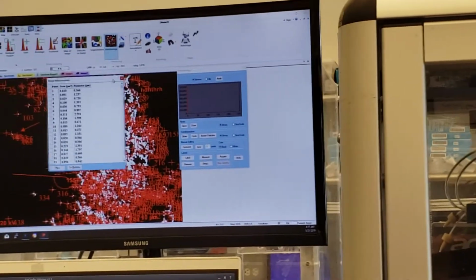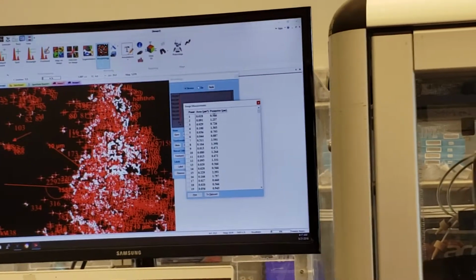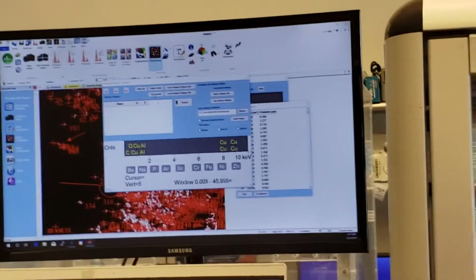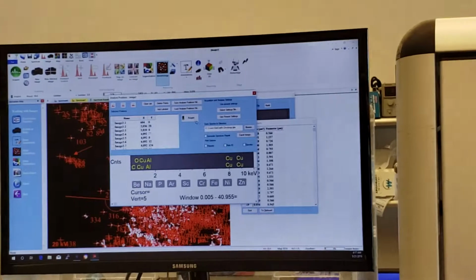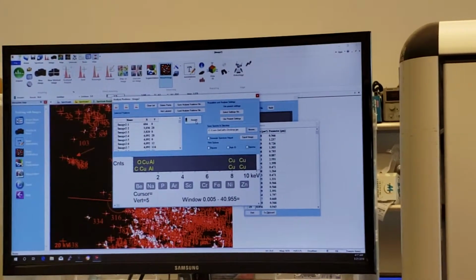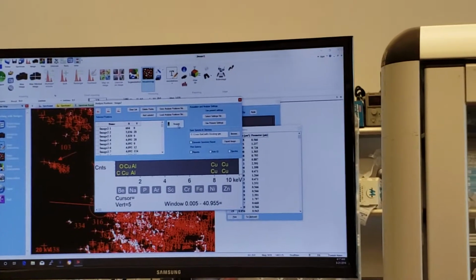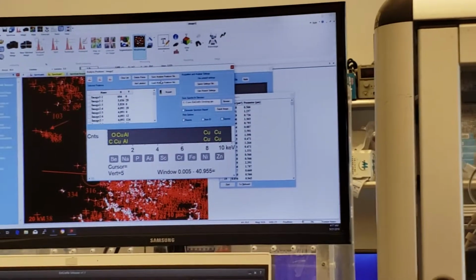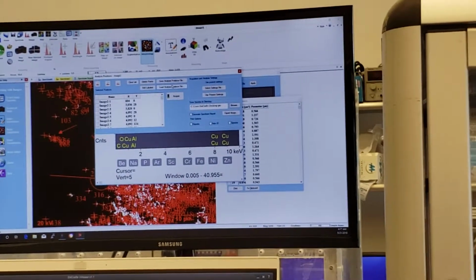And then at this point in time, I'm just going to skip for 1 second. I'm going to go multi-point acquire, and I'm going to go add labeled. I added all those points, and I'm going to hit acquire and do EDS on all those points as well. So not only do I get the sizing of it, and I can do EDS on it, but this is the rough and crude particle analysis. Eventually, when you guys start moving with the software, I'll come in here and do a full training on how to do particle size analysis.